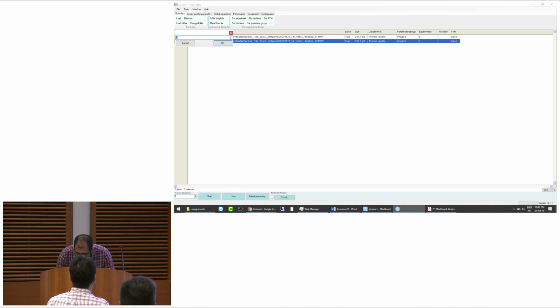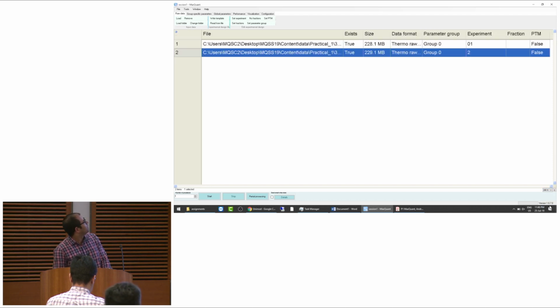Can you zoom in, please? Try. Oh, cancel. Is it better? Yeah. Right.